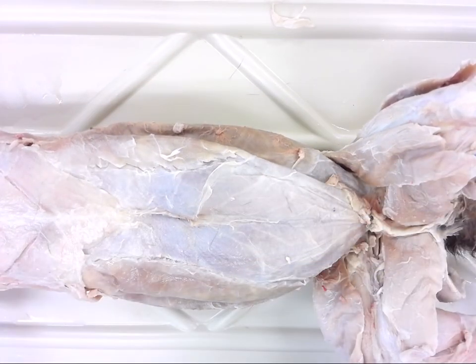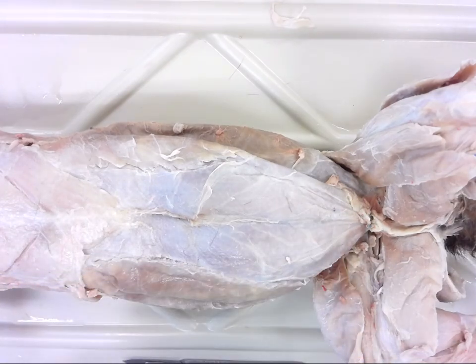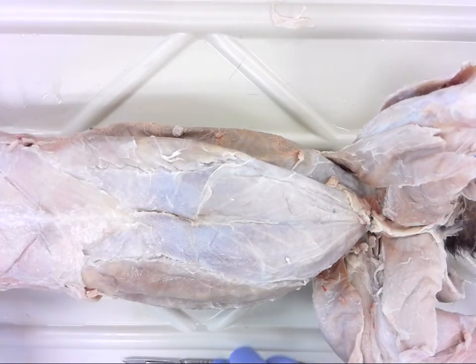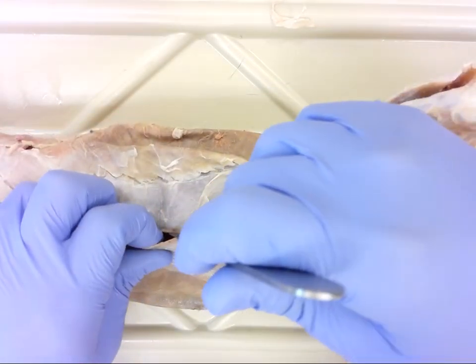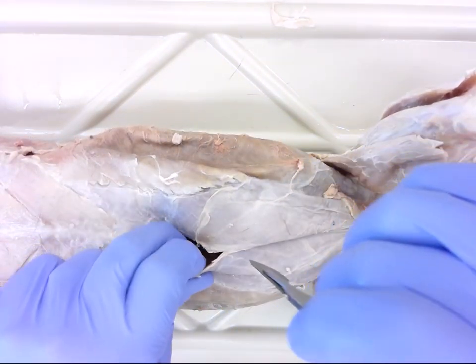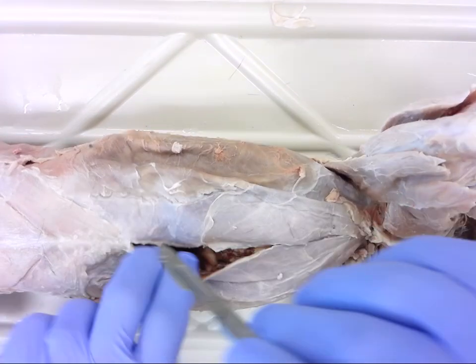All right. The other thing you can do, if you so choose, is you can use the scissors. They're also going to be a good resource for you. I'm going to stick with a scalpel because I'd have to cut down, which would require me to use my left hand. And being right-handed, it would make it a little awkward. So I'm just going to continue to follow this down to the lower abdominal area.